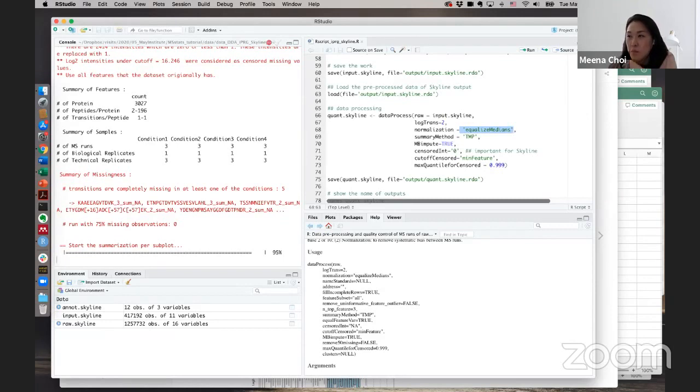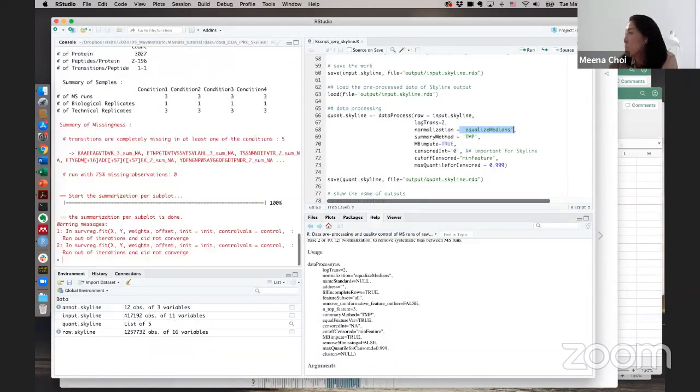For some data processing, DIA takes 45 minutes, larger 20, 40 minutes. It should be 20, not 20 hours, right? Right, yes. So for the DIA case, up to 30, 40 samples, around 5,000 proteins, on my normal MacBook it takes like 30 to 40 minutes. Even with your 32 gigabytes, mine is 16 gigabytes. This is usual. We are trying to make it better than this.